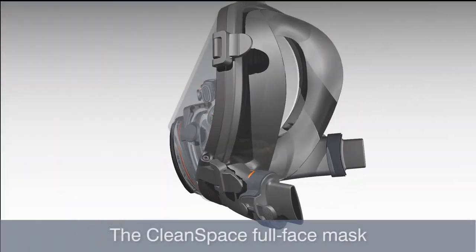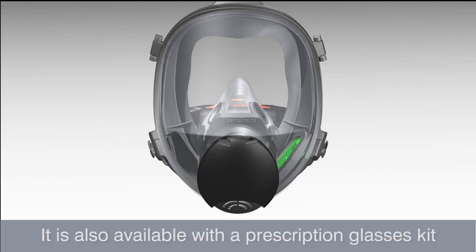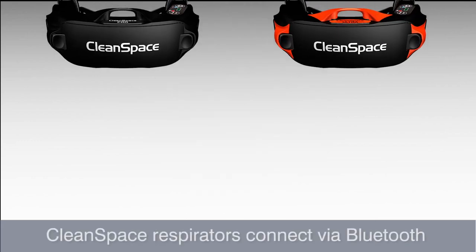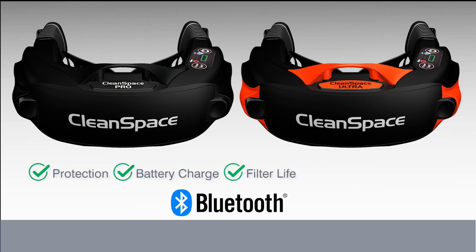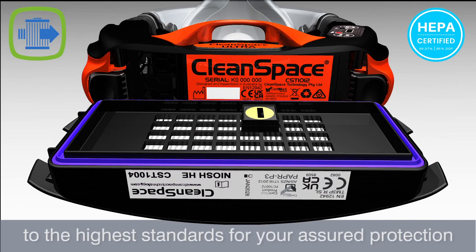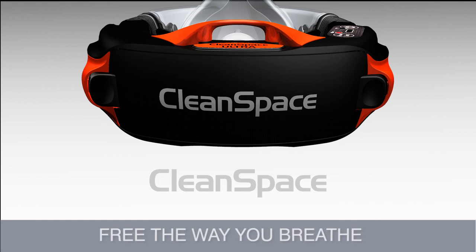The CleanSpace full face mask has a wide silicone mask cushion and a speech diaphragm which aids in communication. It is also available with a prescription glasses kit. CleanSpace respirators connect via Bluetooth to a smart device providing real-time information on protection, battery charge, filter life and much more. CleanSpace respirators are HEPA certified to the highest standards for your assured protection. CleanSpace respirators — free the way you breathe.